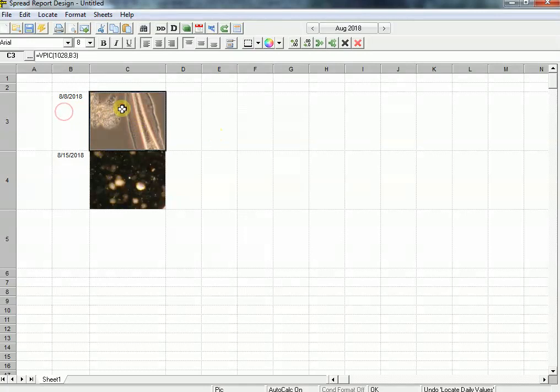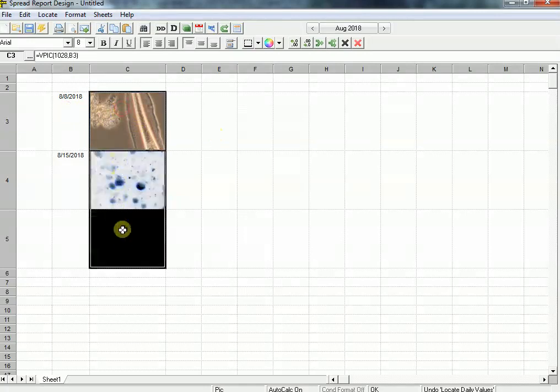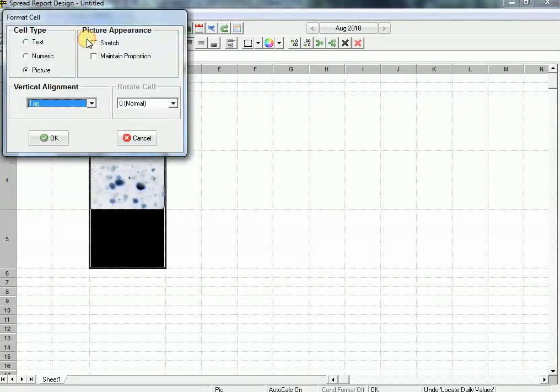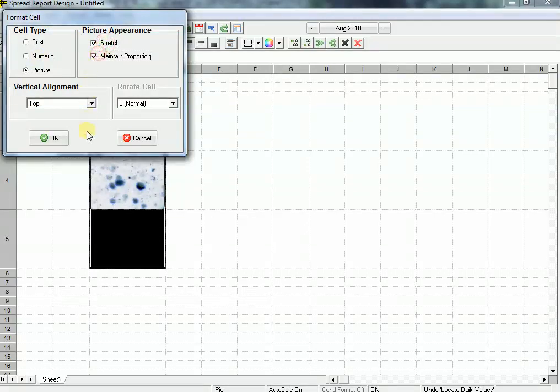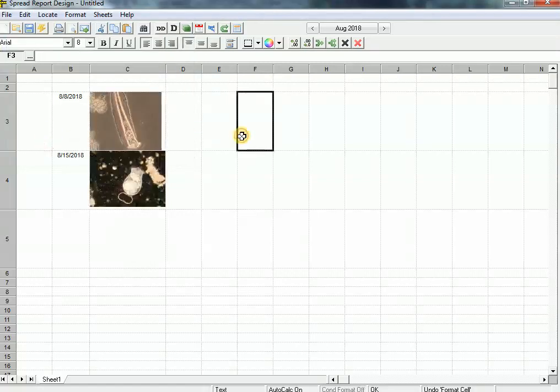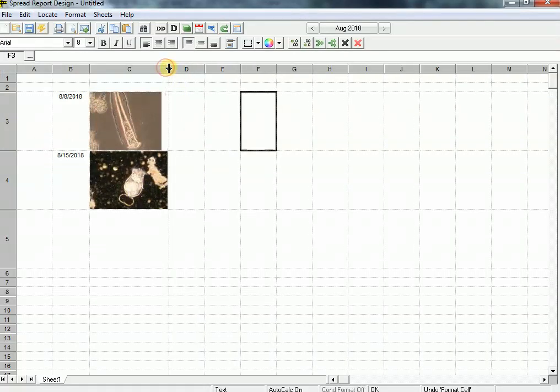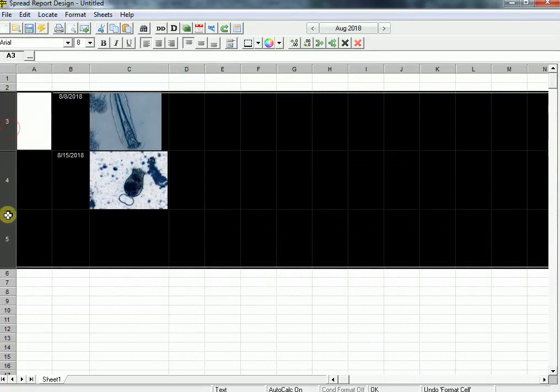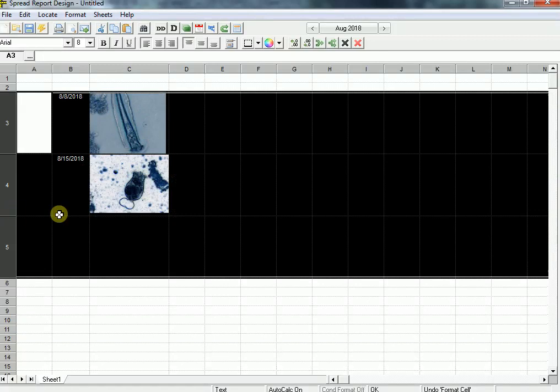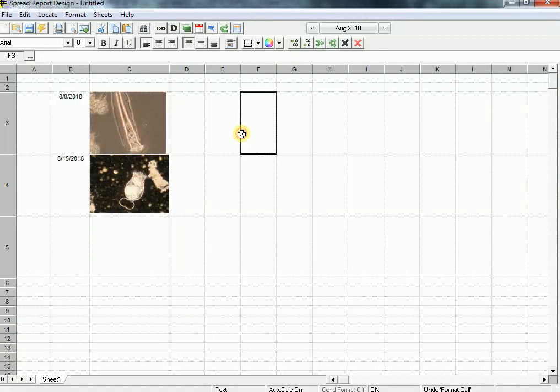Now I can also format these cells as pictures and I can stretch, which means fit it into the cell, reduce or increase the size to fit the cell. If I do that, I get a little bit of a better picture. I may want to tweak it just a little bit. That's really it for picture type variables.